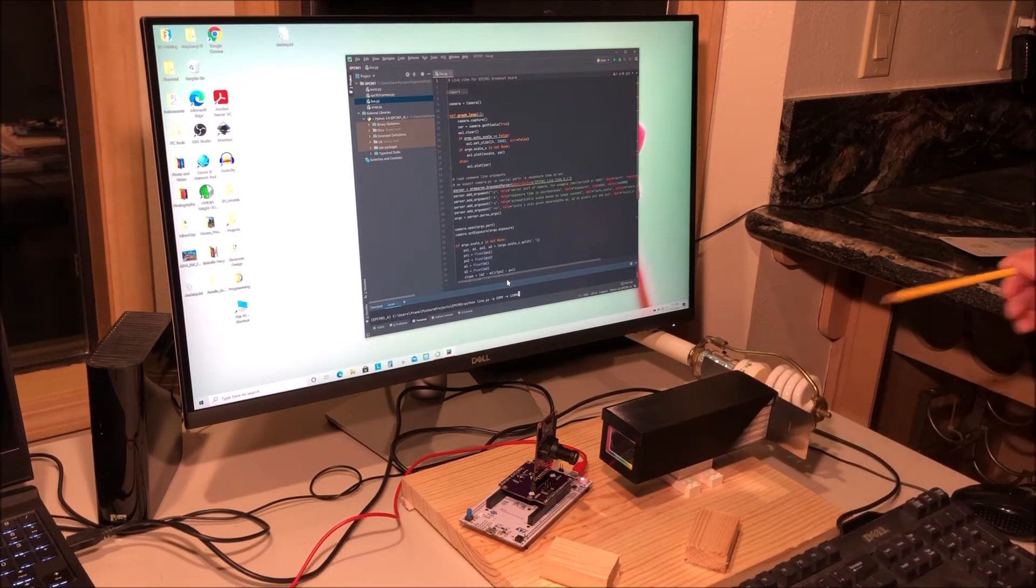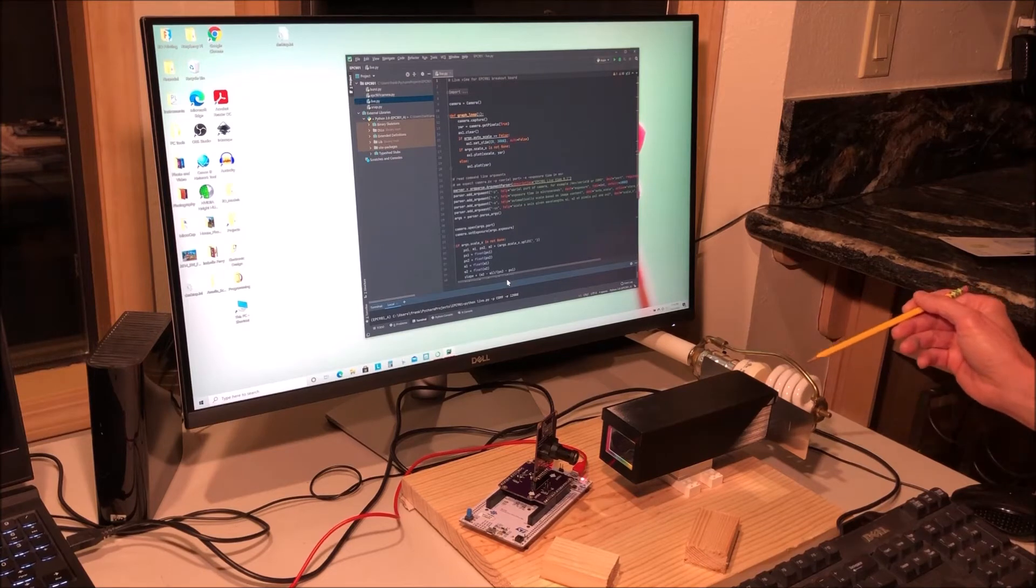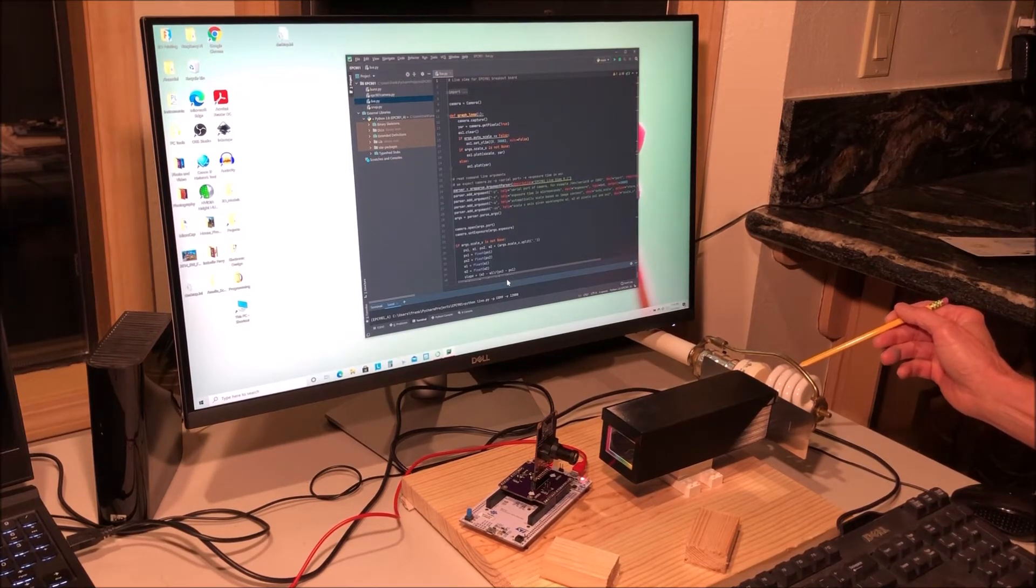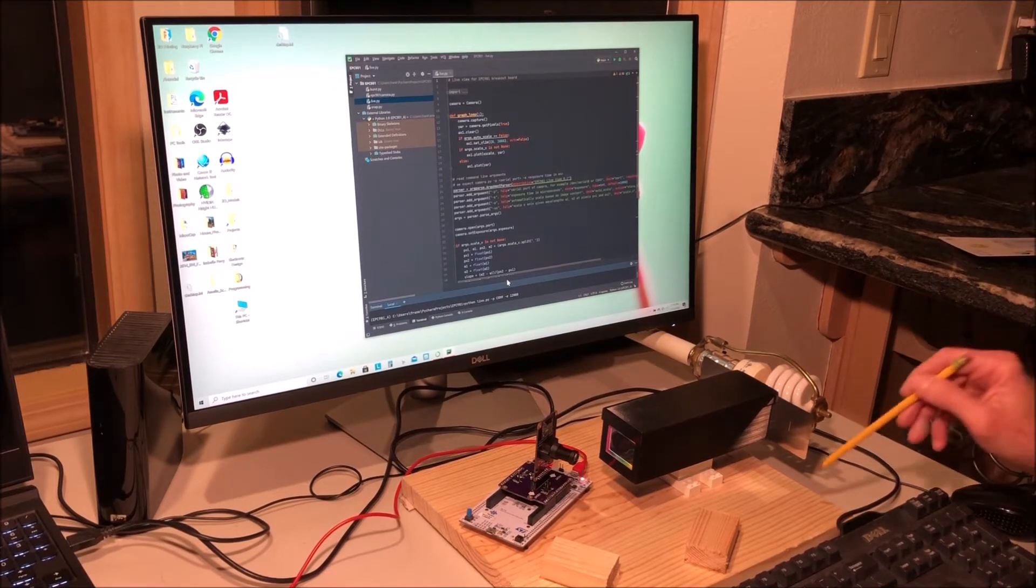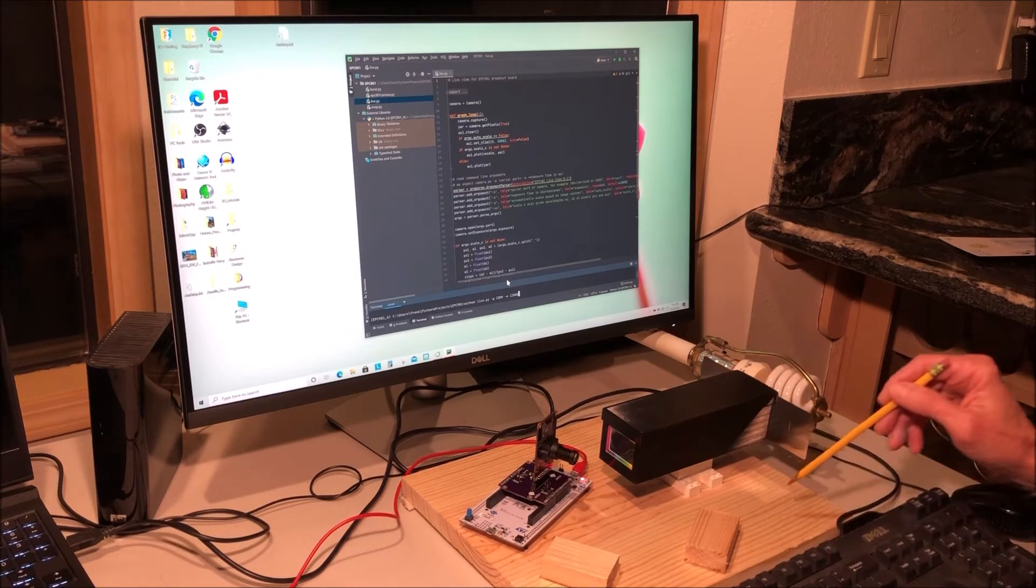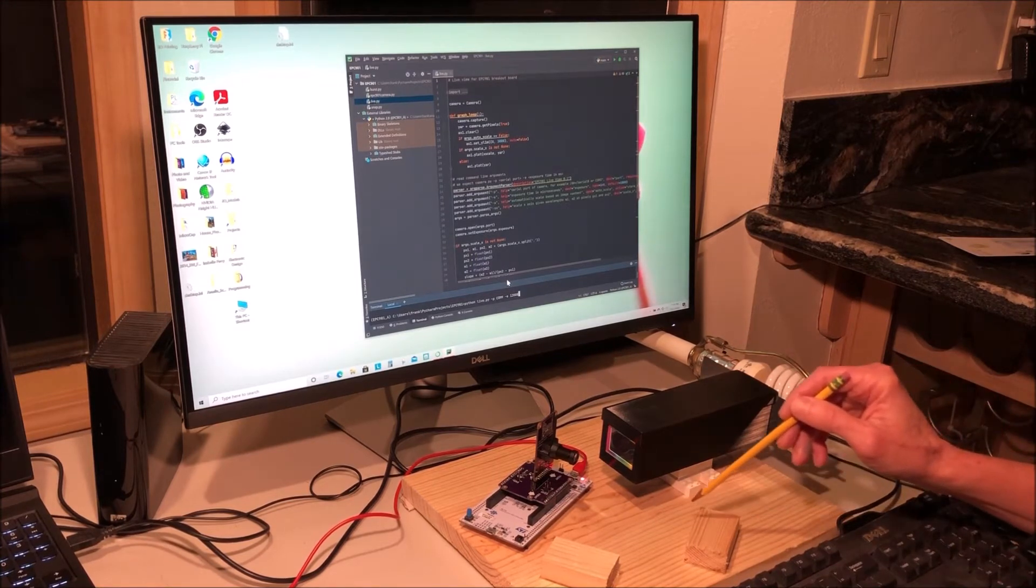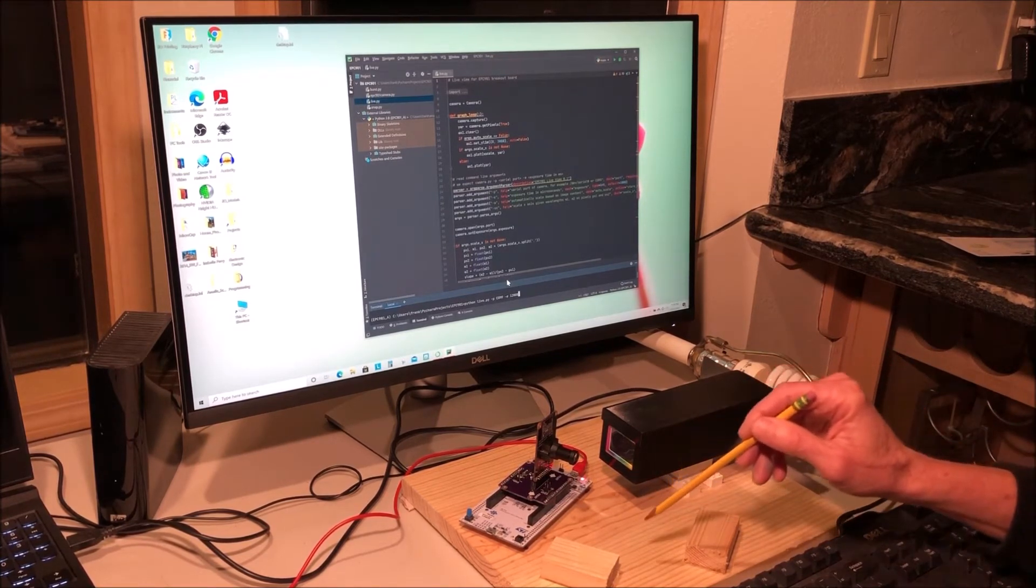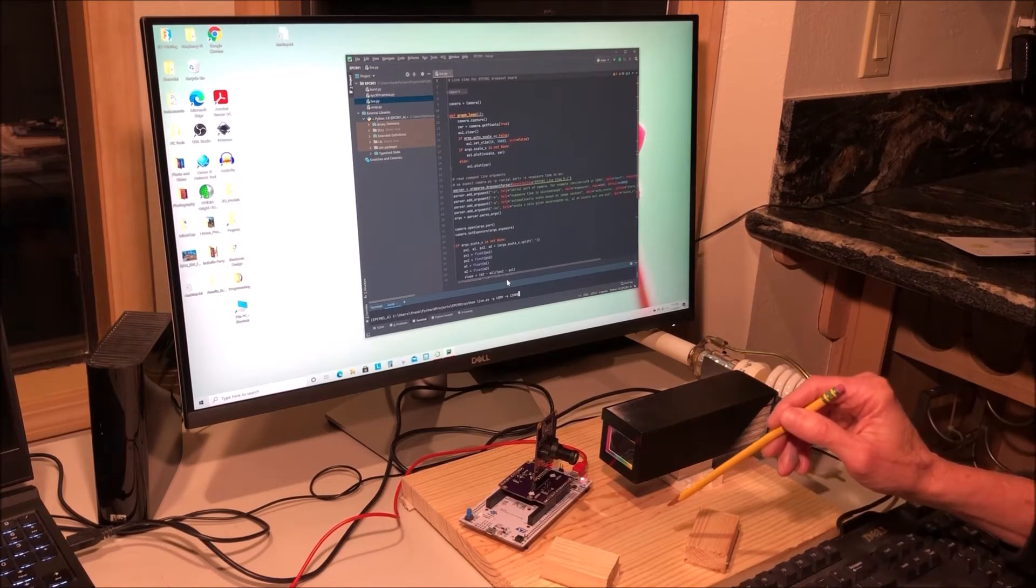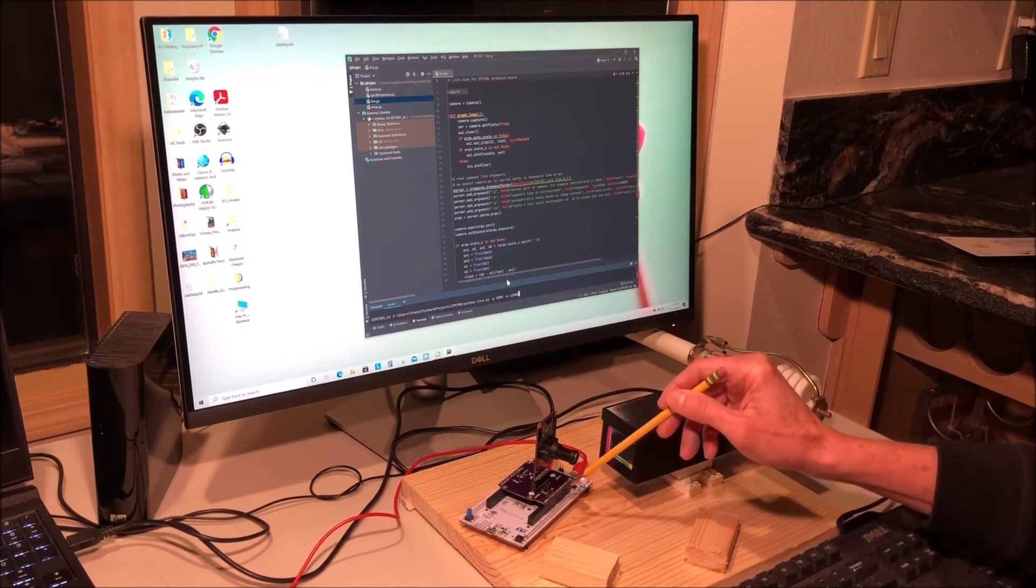We have a CFL lamp over here that we'll use as a light source to develop and evaluate a spectrograph. There's a wooden alignment platform down here that holds things and is used to ease the alignment of the spectroscope.